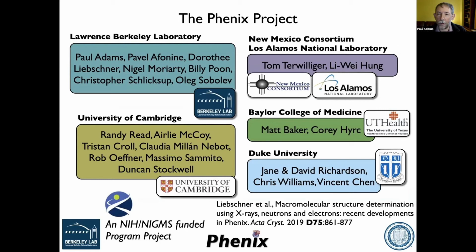And the last question is concerning the atom displacement factors. I do have the special case that the PDB that I'm using to simulate the map was actually refined against the cryo-EM map I'm going to use to compare it to later.